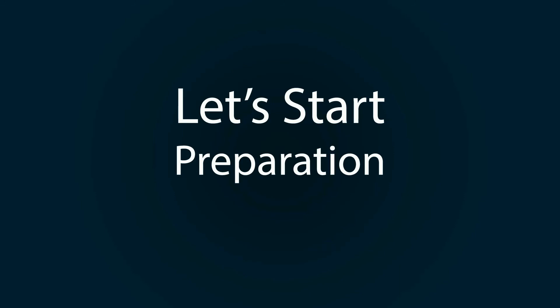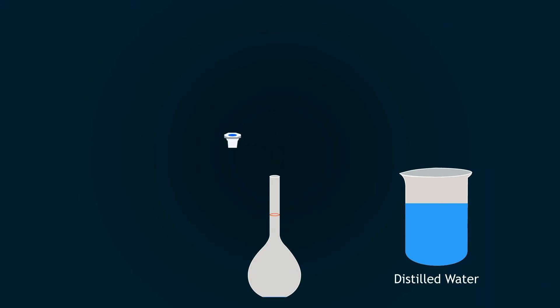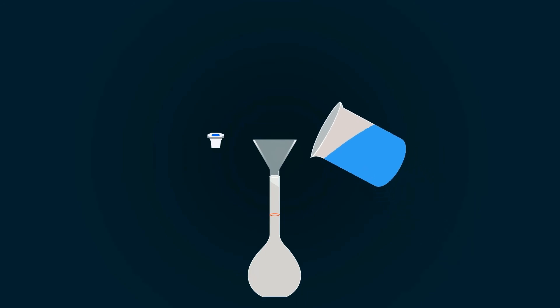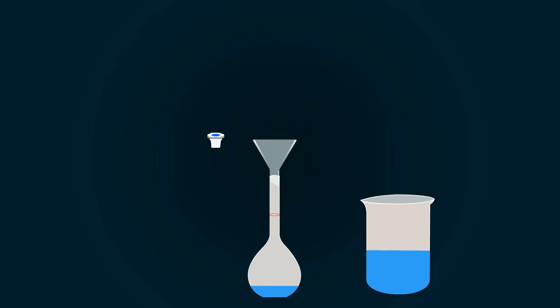Let's start our preparation. First, take a volumetric flask and add some distilled water into the flask with the help of a funnel. While handling concentrated acids, please add some distilled water into the volumetric flask before adding any kind of concentrated acid.